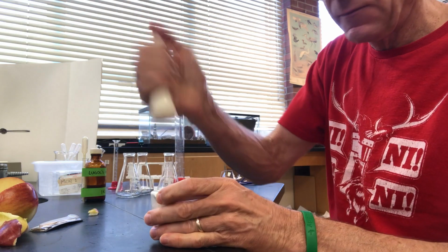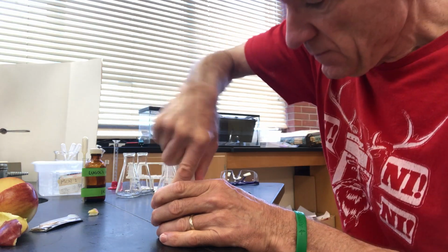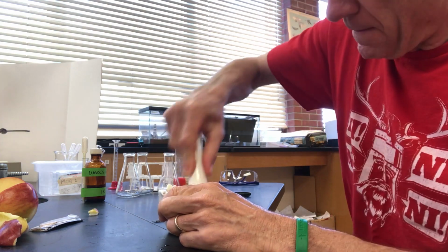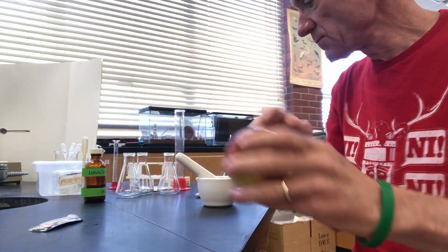To determine the macromolecules present in the various food samples will require making solutions of each food. Preparing solutions from the food samples will require grinding pieces of the food sample with a pestle and mortar and then adding water to solubilize the compounds in the food. We'll begin with the apple.